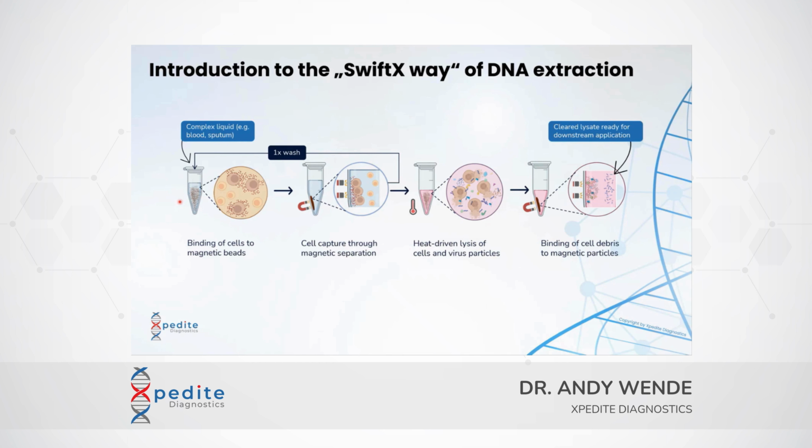The goal was to find, from an extraction point of view, methods or validate methods that are capable of being used at the point of care. For that, the methods need to be rather simple, despite the fact that mycobacteria are usually not easy to destroy and the DNA not easy to release. We still tried it with different methods. One of them was SwiftX DNA and other components of our SwiftX toolbox at Xpedite.